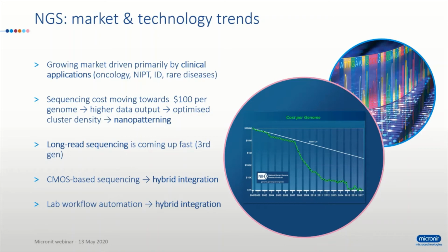As I briefly brought up already, the market is growing and it's driven primarily by clinical applications. This is an important note, because it means that we have to switch from a research use only environment to a clinical diagnostics environment. This means that we have to start developing and manufacturing these parts in a different way, keeping in mind that in the end it should be CE marked or FDA approved to be able to use it for diagnostic applications.